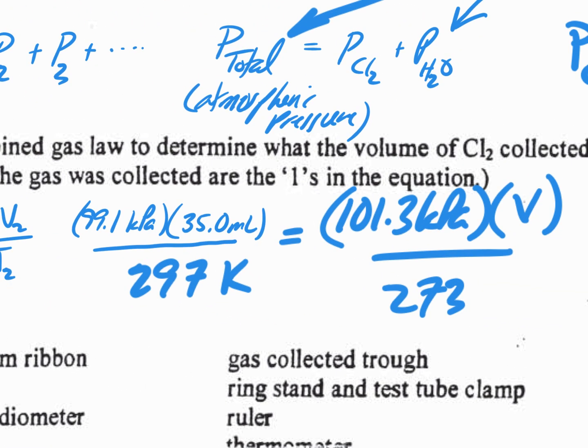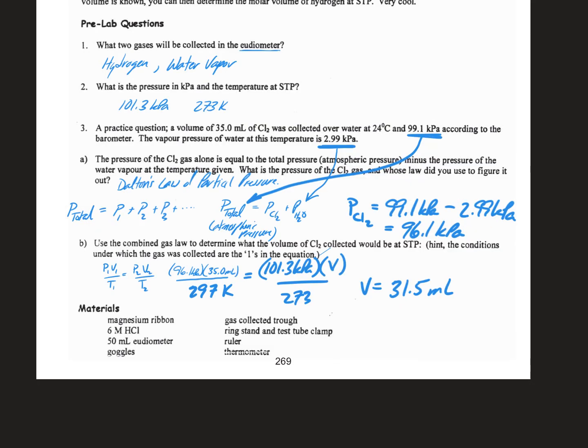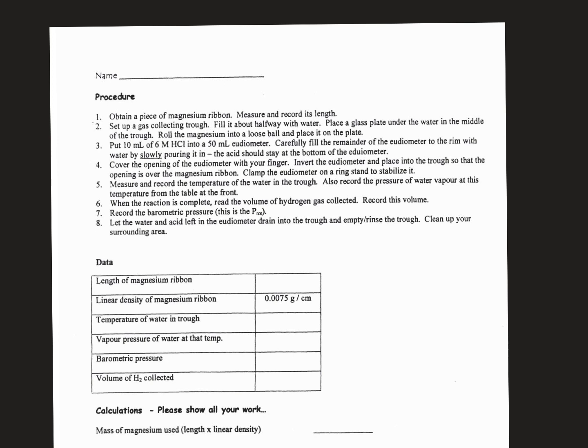These are the values that go into that, and the volume calculates to be 31.5 milliliters. Okay, let's move on to the experiment, and here we go. The experiment that you watched in the video was done slightly differently than we would have done in class.